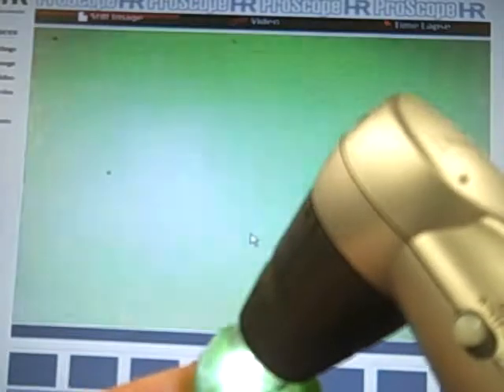I'm going to try this leaf. So I'm going to press the microscope down onto the leaf and you can see that there are different things to look at here. You can talk about the different parts of plants and however you would use a regular microscope. But now it's up on the screen.